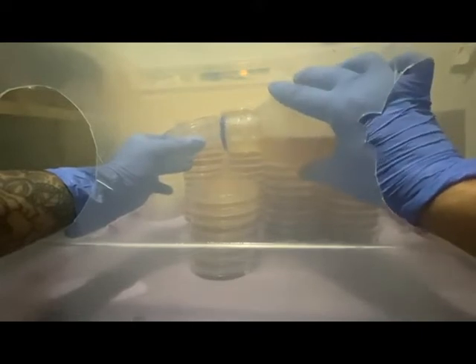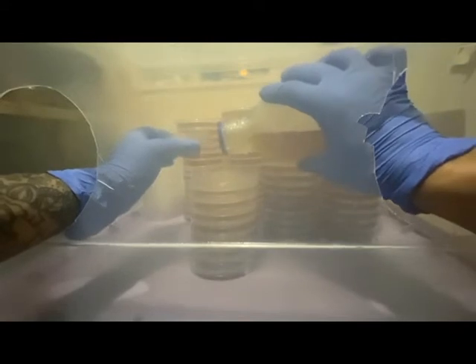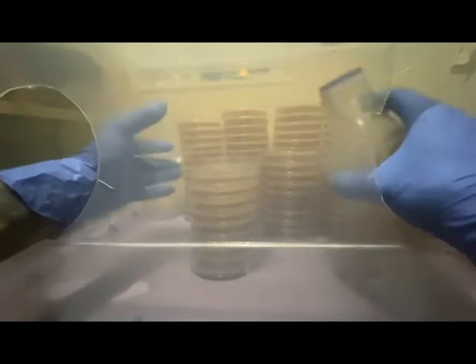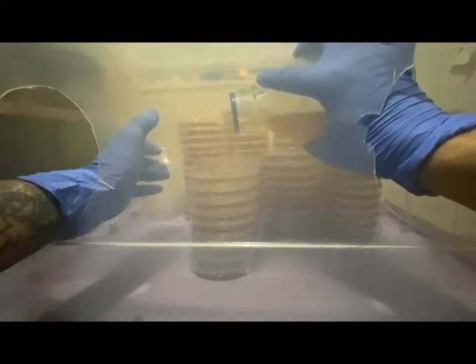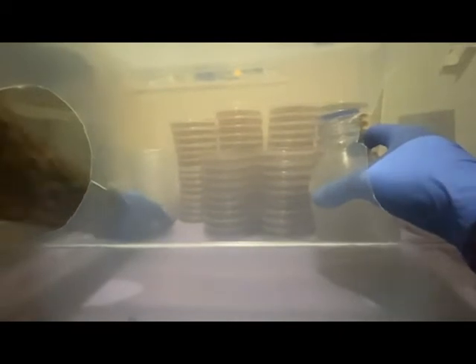And personally, that's why I do like to pour at higher temperatures, despite the condensation. You know, I sell Petri dishes on Etsy, and of course I can't sell my normal customers plates filled with condensation or bubbles or chunks like I'm getting pouring out of these too slow.